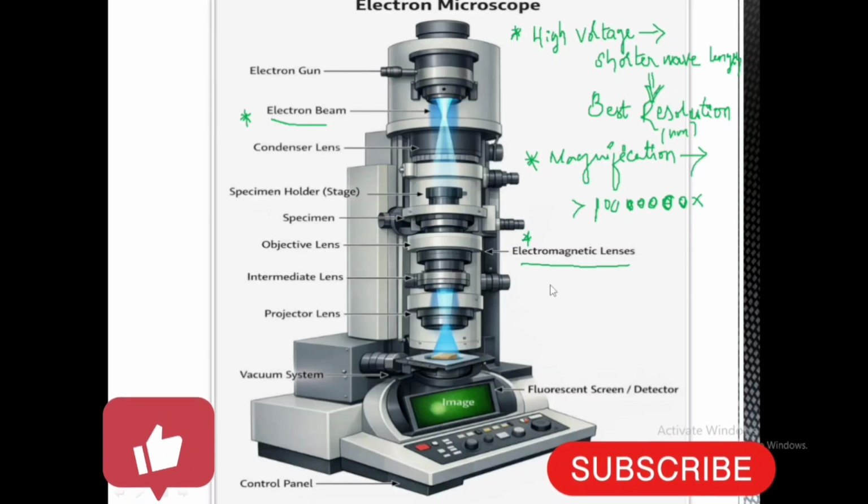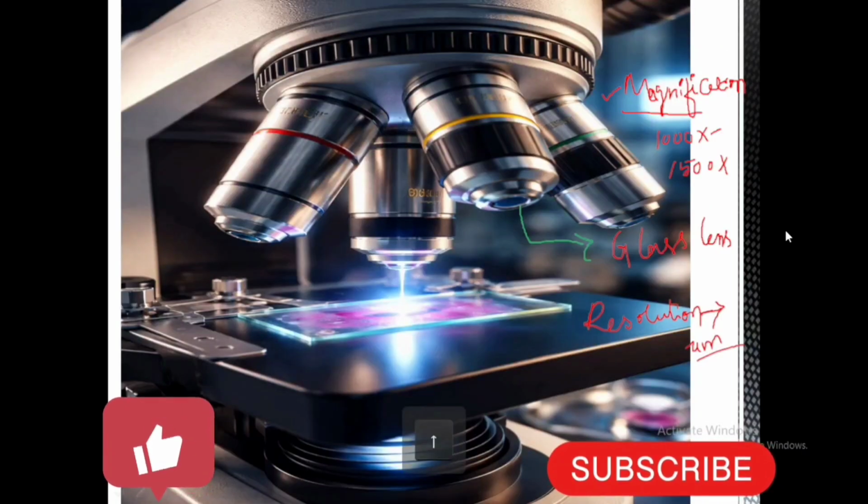Next, resolution. The light microscopy resolution is good; the electron microscopy resolution is the best. Because the light rays have a longer wavelength, and a longer wavelength gives less resolution of the image. Only micrometer-thick images we can watch through the light microscope.